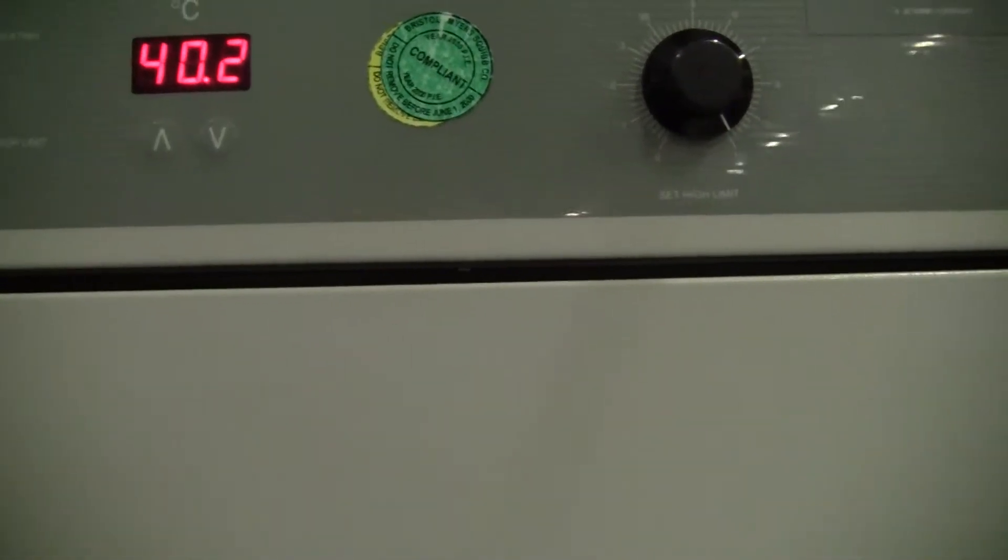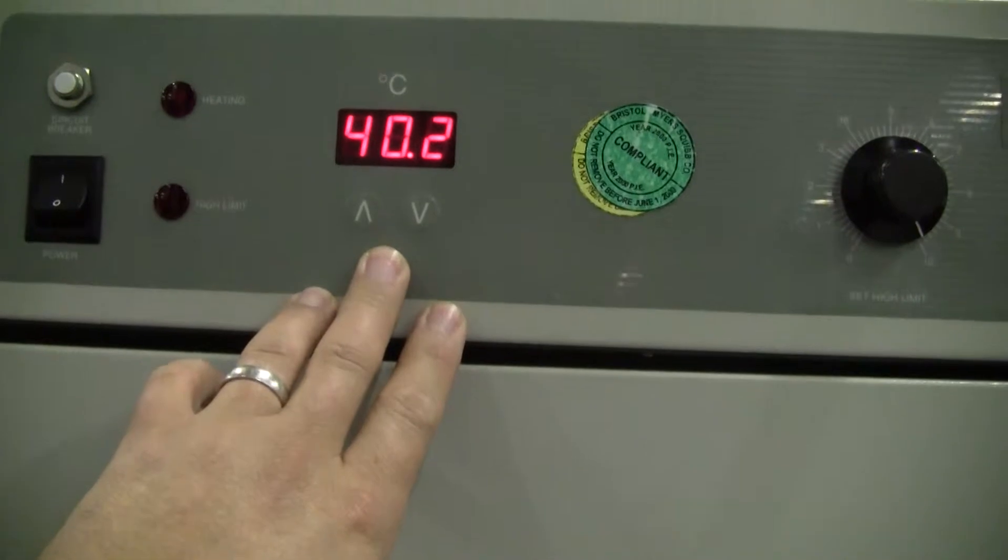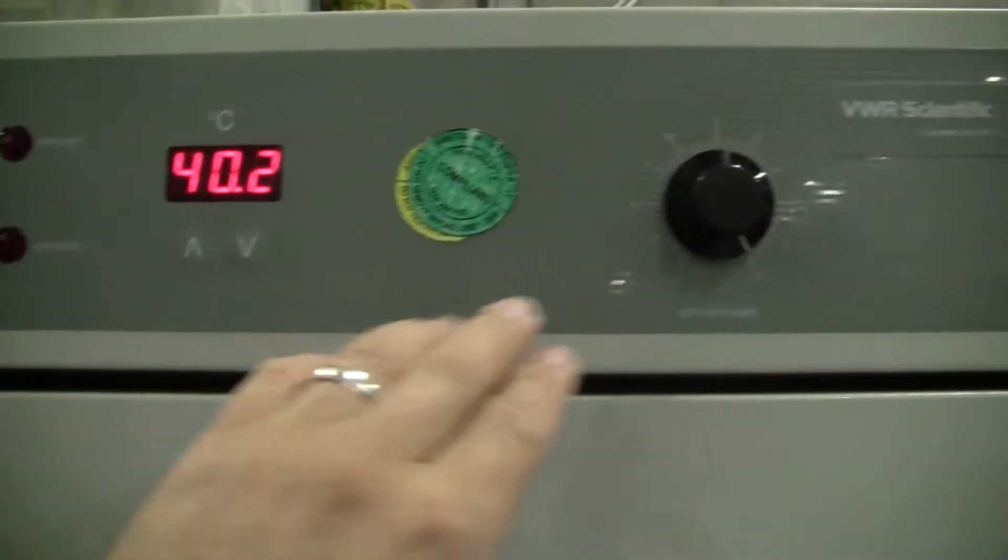This particular model has a very basic design: set point, microprocessor controlled, and over temp.